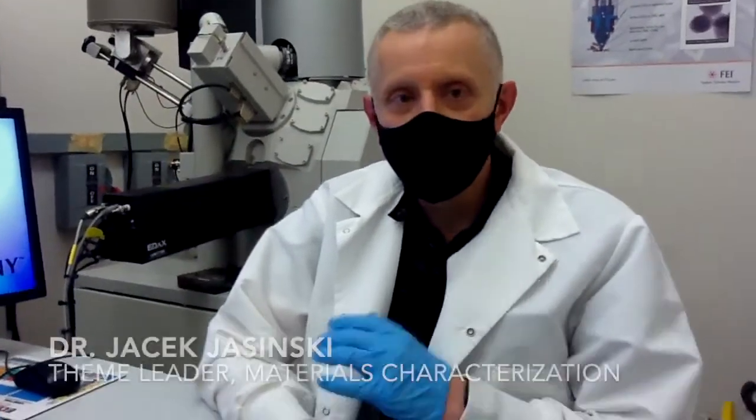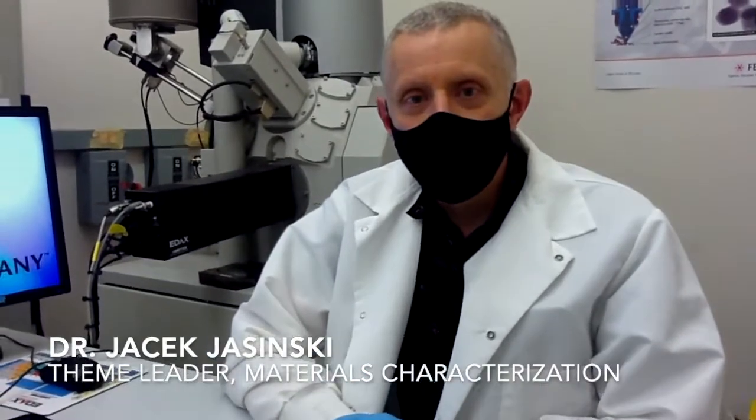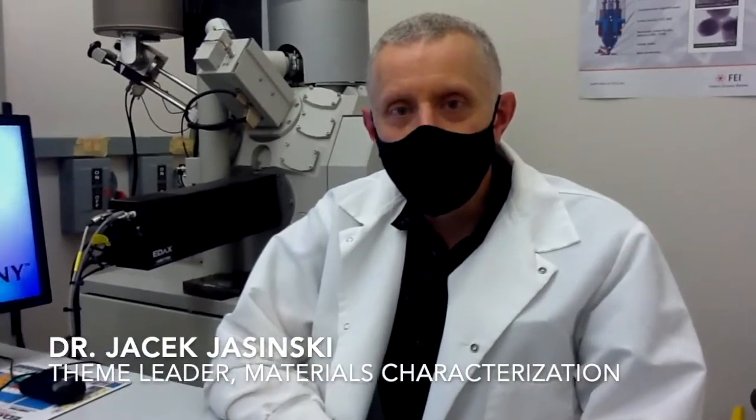Today I will show you the basic steps for field emission gun SEM. I will show you how to initialize the server, how to get access to the microscope control, then how to load your sample, prepare the column for the operation, turn on the beam, optimize the image, save it, and then go to high resolution mode if you need to do it.